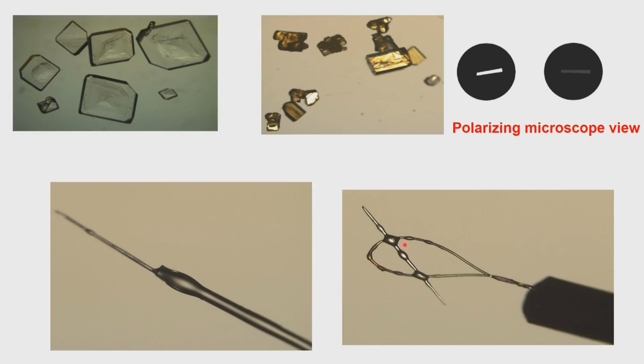And this is essentially oil, and the oil that we use is very special, paratone oil. So, it is the paratone oil which we use in order to mount the crystal. So, we make use of the paratone oil and we mount the crystal on this loop. This is now the most common method which is used because there is no interference of either glass or any other material with the system, and also at the same time the crystal is now completely bathed in the incoming beam, which is a requirement for a quality diffraction.